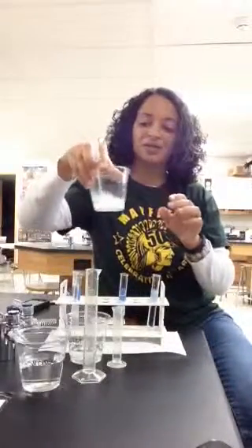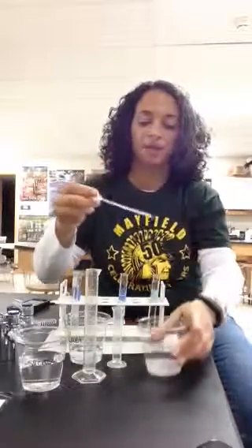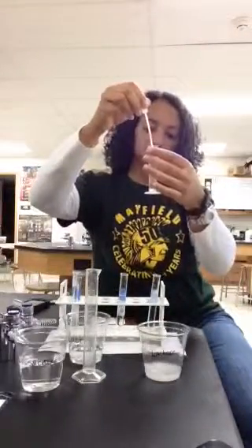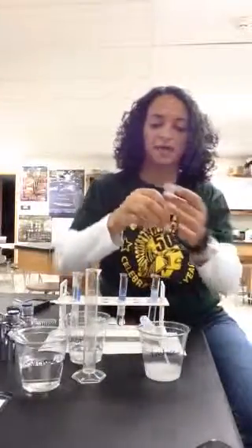So I have my cup of lactase. I'm going to swirl it around a little bit. It tends to settle to the bottom. And I'm going to suck some up here with my pipette. And I need 1 milliliter of lactase. So I'm going to go ahead and dump out the extra water. And I'm going to fill this up to 1 milliliter of lactase. Okay, squirt the rest back in my cup.